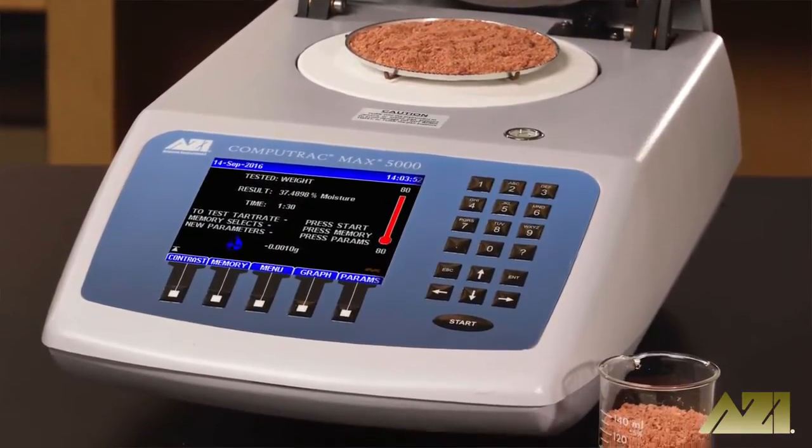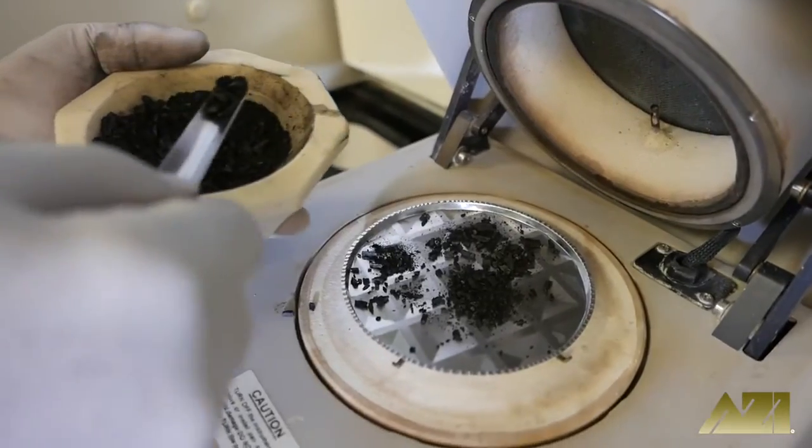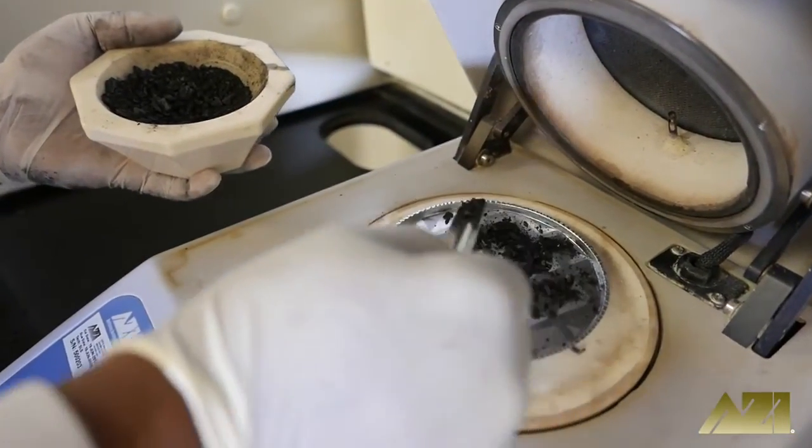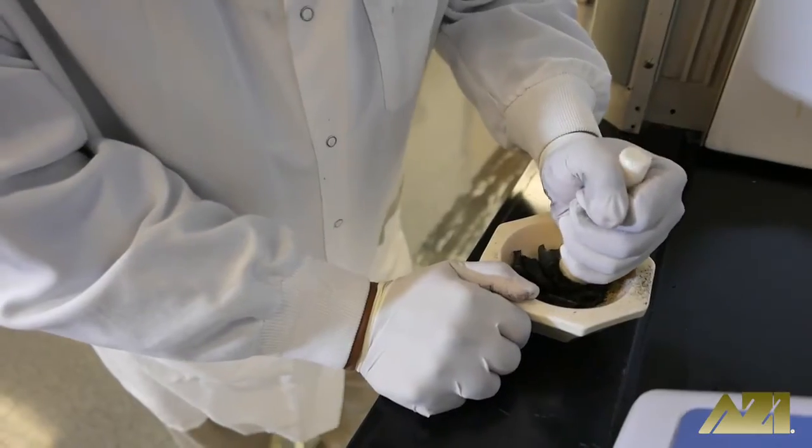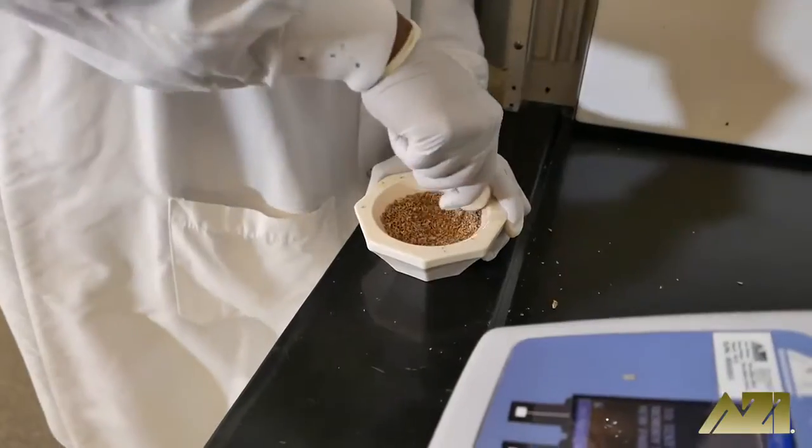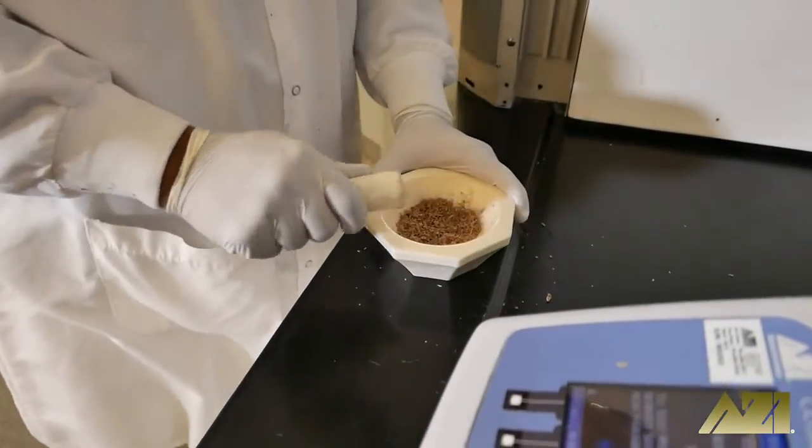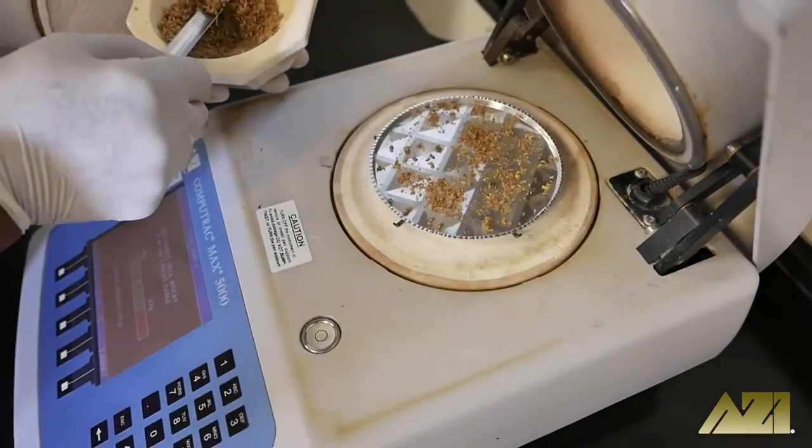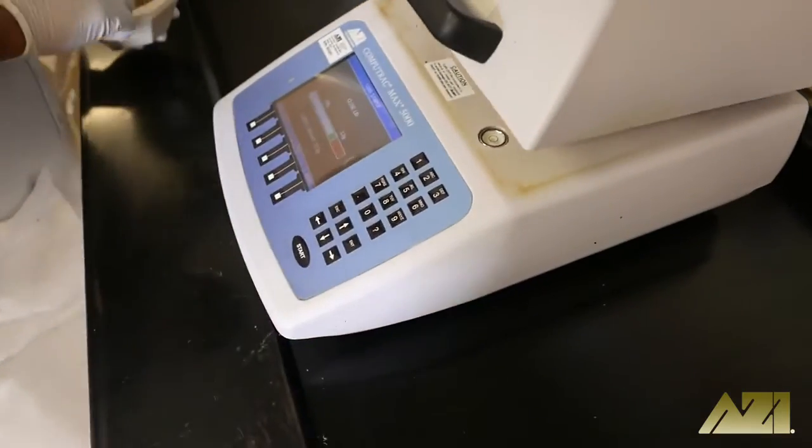After placing the sample pans on the pan support, we zeroed the balances and placed an appropriate amount of sample on each pan. Both the wood pellets and the lump charcoal were ground using a mortar and pestle to increase their surface areas. Once the samples were loaded, we closed the lid on each analyzer and began the test.